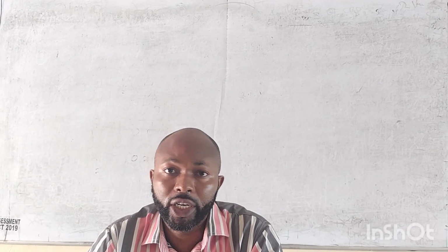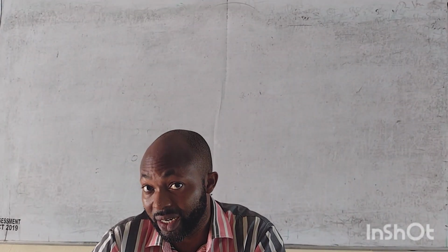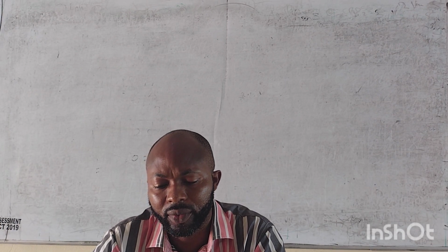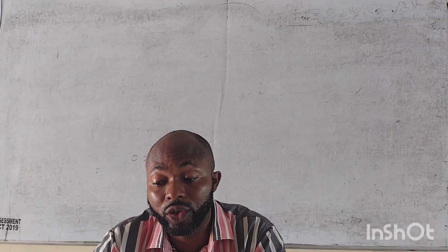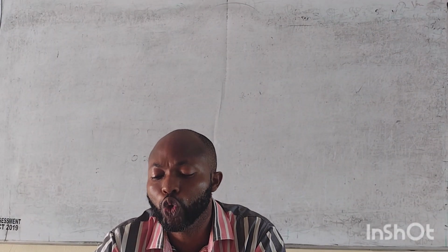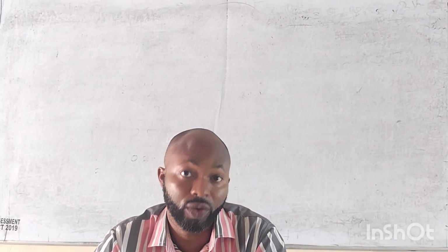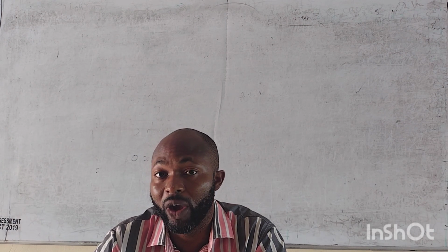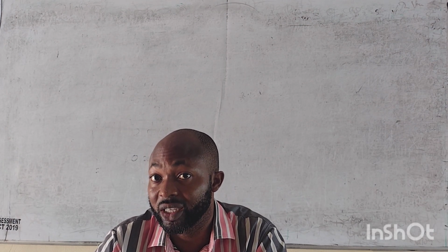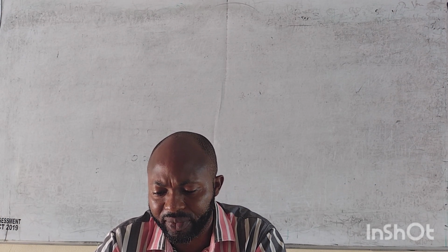Today we're going to be taking a topic: qualitative inorganic analysis. Qualitative analysis in general is the part of chemistry practical that deals with determination of constituents of substances, whether organic or inorganic, which means we have organic qualitative analysis and we have inorganic qualitative analysis. But our business today is inorganic qualitative analysis.